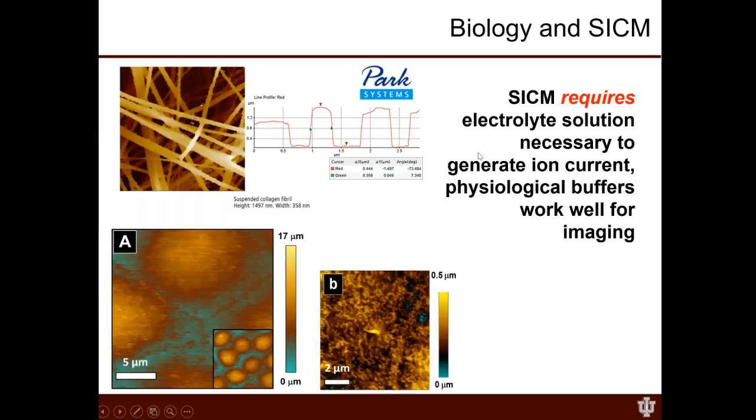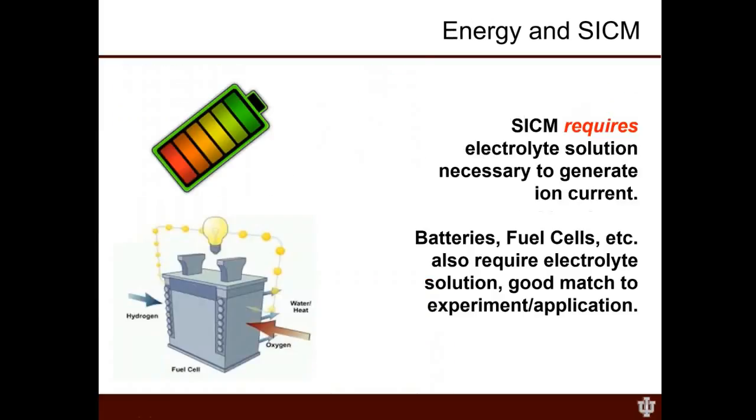The other place where SICM has some advantages is in making measurements related to energy. And by energy measurements, I'm talking about things like batteries or fuel cells. An electrolyte solution is also required, typically.